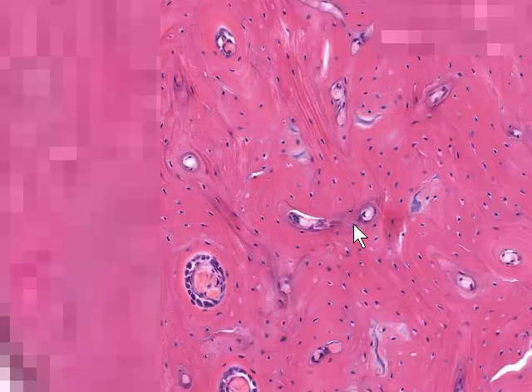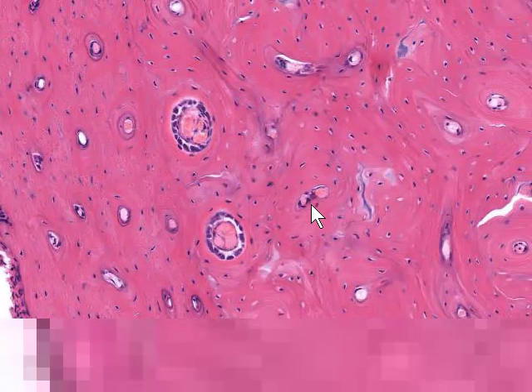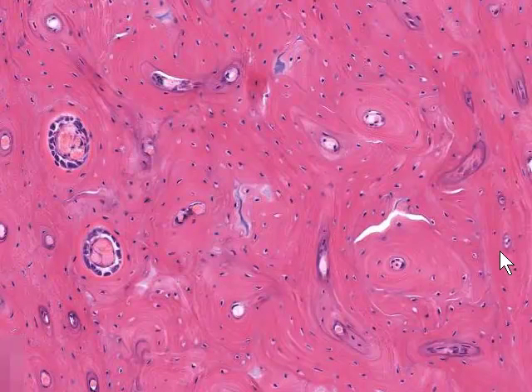If you've looked at the ground bone slide at this point, in fact what you see here will be immediately familiar to you. So here we have osteonic bone. Sometimes we can see very obvious looking osteons, and in other places we can see rather complicated shapes of osteons, and this really just reflects remodeling that's taken place. The small holes we see here, for example here, this is a Haversian canal. Here are osteocytes in their lacunae which surround this canal, enclosed in their bony lamellae.